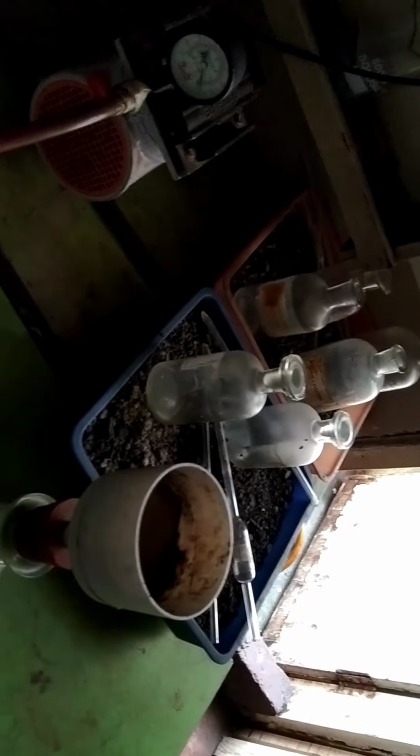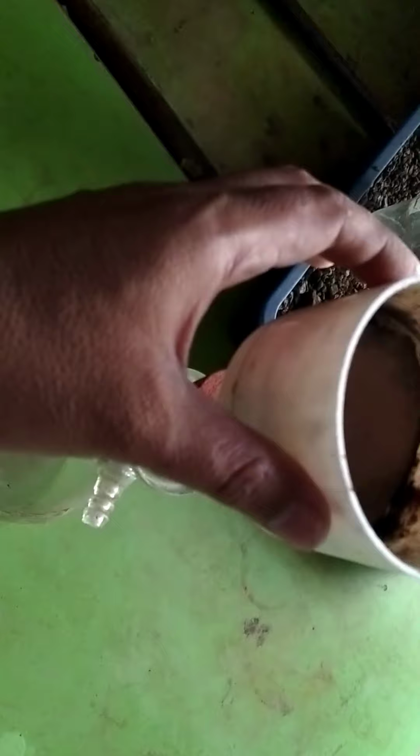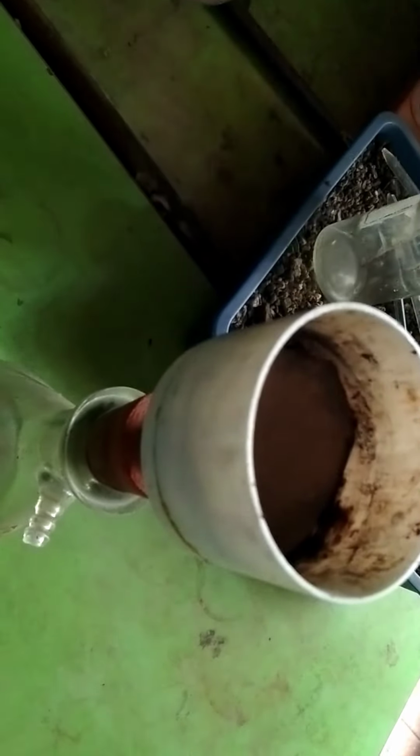Precipitated solids are separated using a Buchner funnel on filter paper. For that, suction is applied with the pipes. Pipes are attached to this type of assembly, and the solution is applied at the top of the Buchner funnel. The solvents get separated and we get the precipitates on the paper.